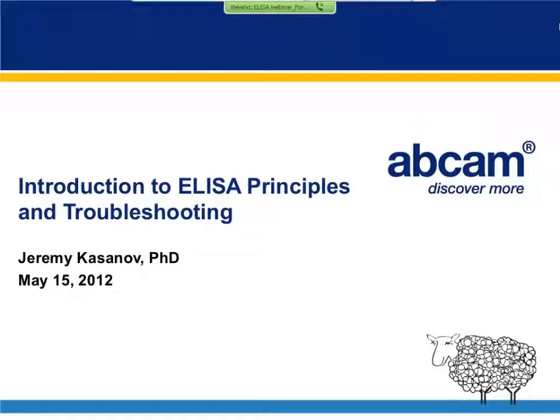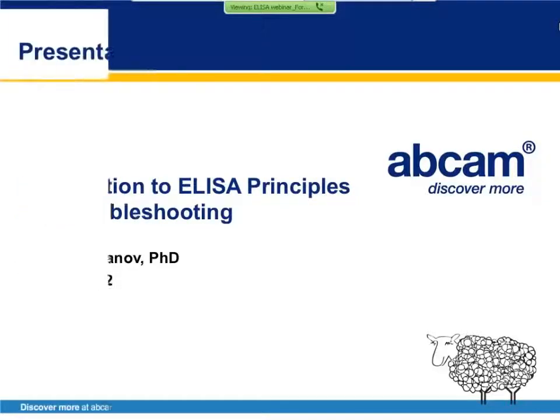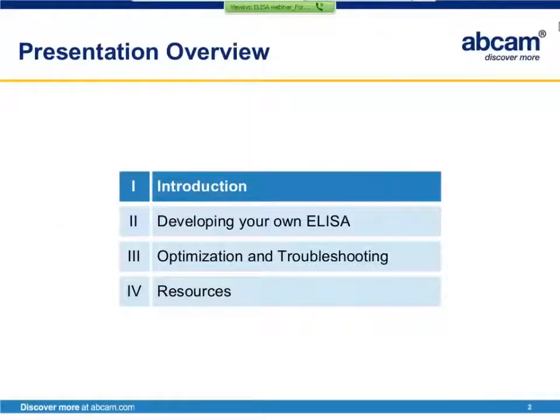I'm happy to be able to present this webinar entitled An Introduction to ELISA Principles and Troubleshooting. I'll begin with an introduction to the ELISA application and give an overview of the most commonly used ELISA formats. Then we'll go on to discuss important reagents and equipment, as well as considerations when deciding whether to develop your own assay or to purchase a pre-made kit.